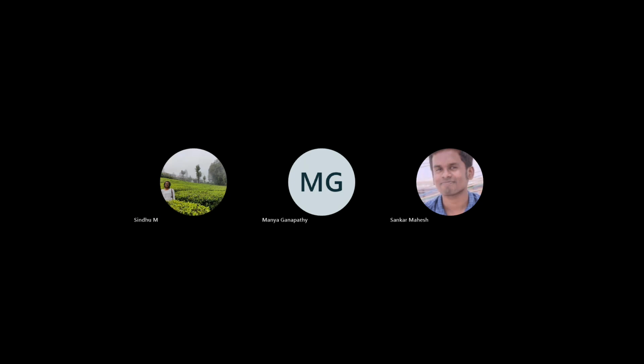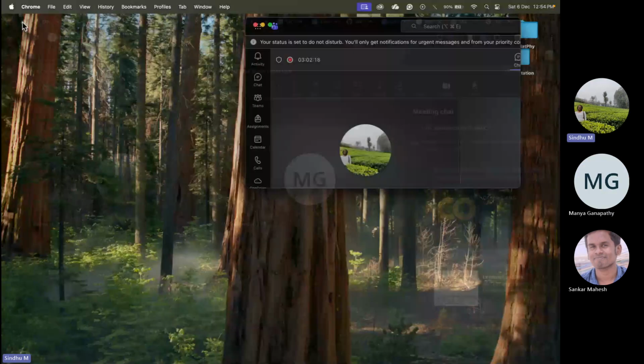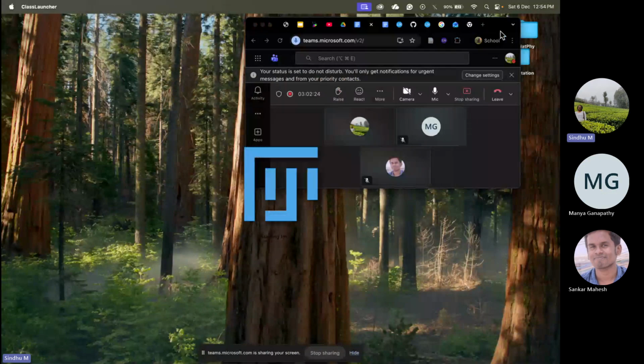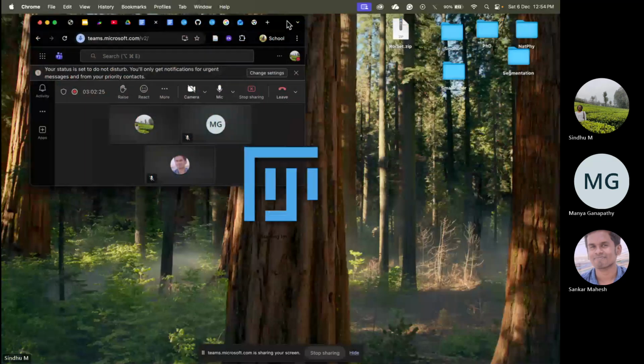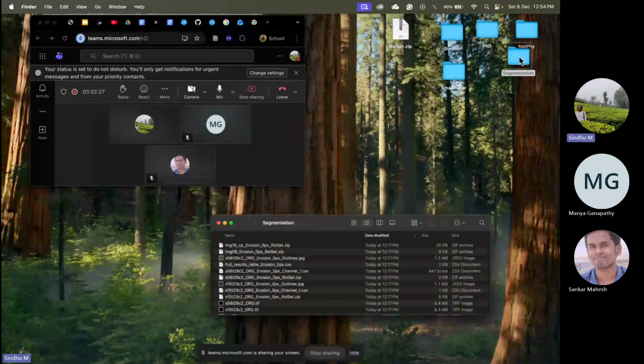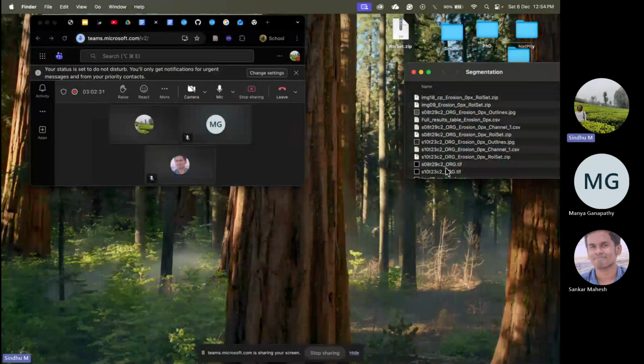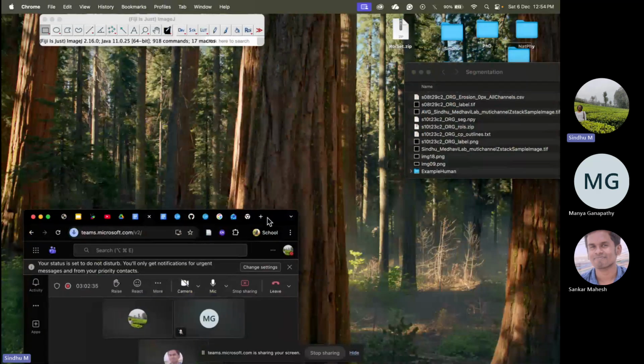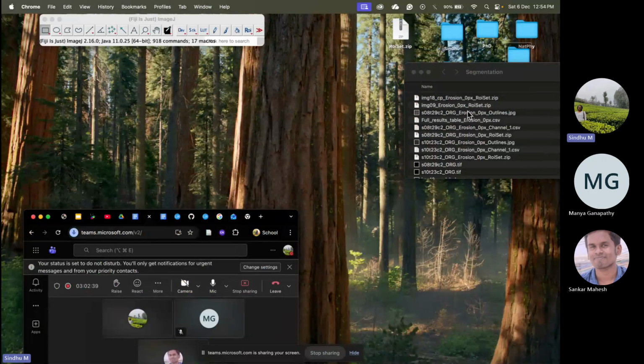Okay, this would be easier to explain with Fiji open. When you open an image and move your cursor to a particular point, if you look at the top of the Fiji bar, it shows you some information. So let's open this, for example.